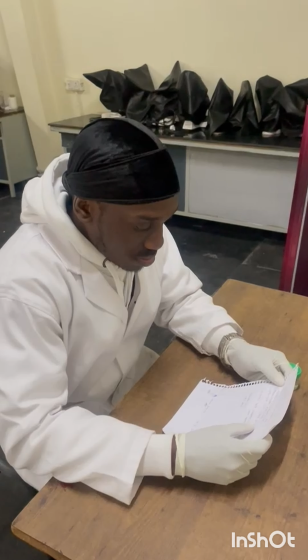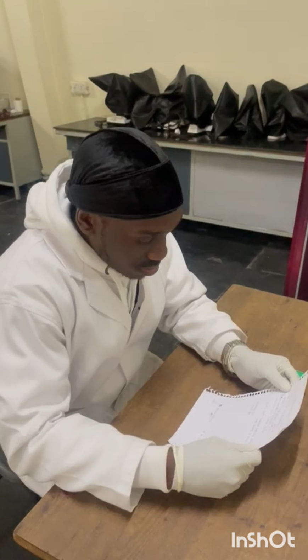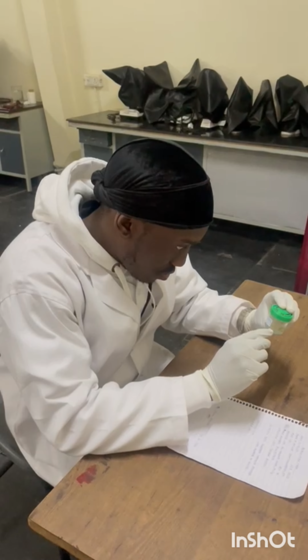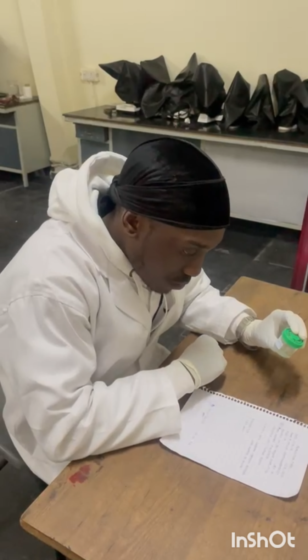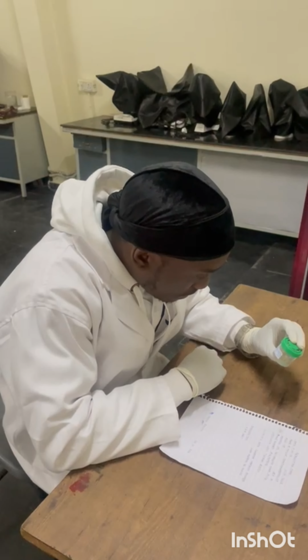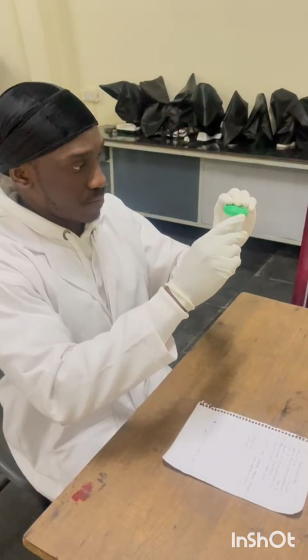The next stage is data entry and tracking. Entering the sample's information into the laboratory database or tracking system. Tracking the sample's progress throughout the testing process. Proper sample reception is crucial in histopathology as it sets the stage for accurate and reliable diagnostic testing. Here are the importance and implications of proper sample reception.